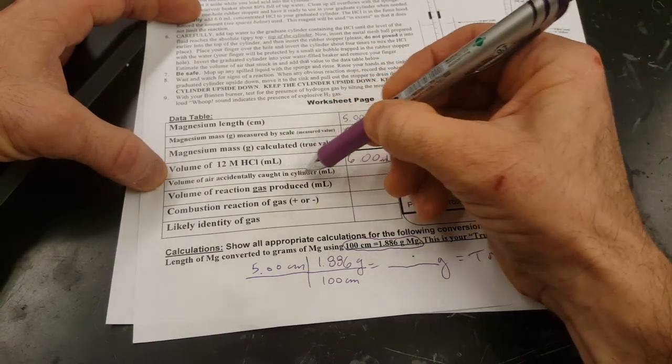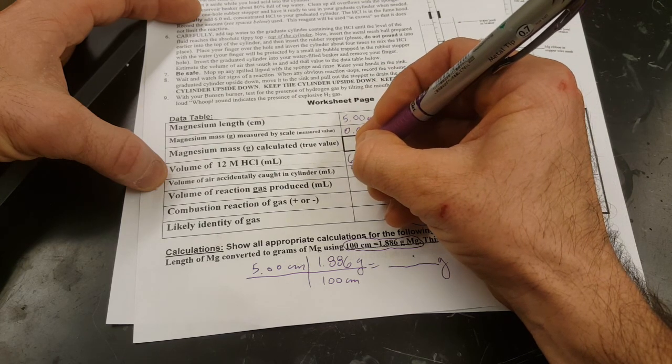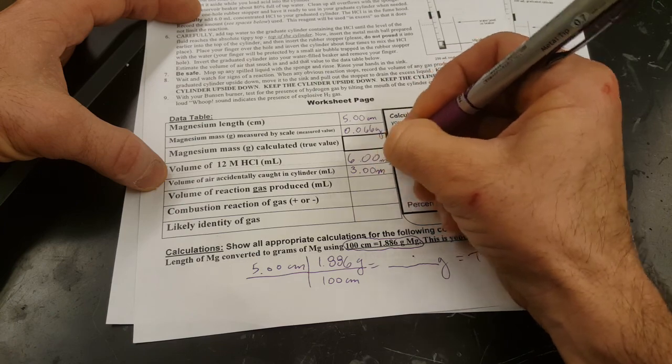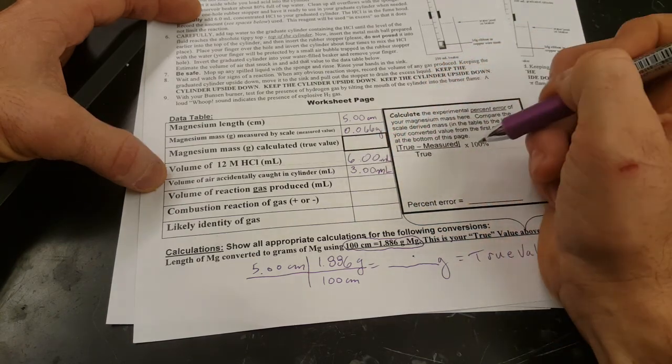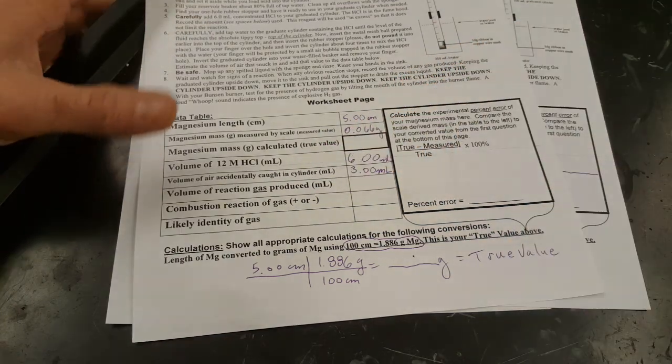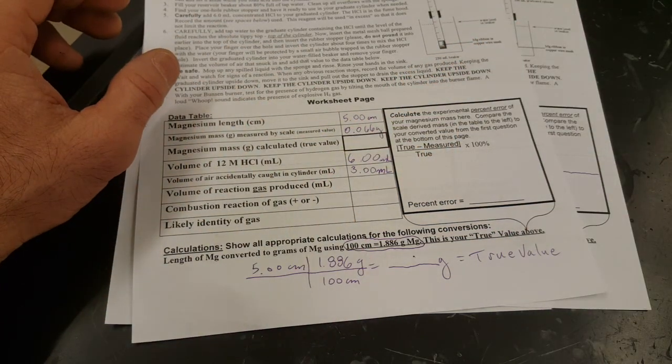Volume of air accidentally caught in the cylinder, that later is going to contribute to my error. That's to the best of my ability. Volume of the reaction gas produced, that's what we're waiting on right now.